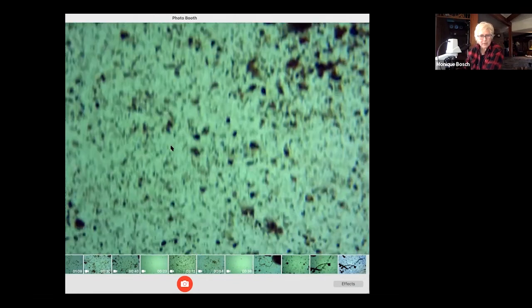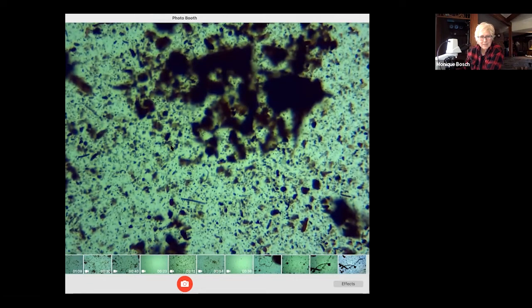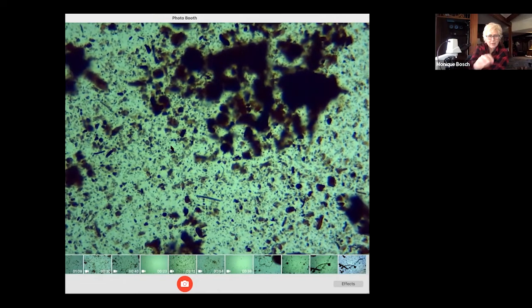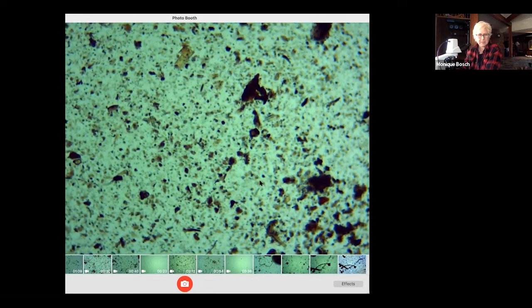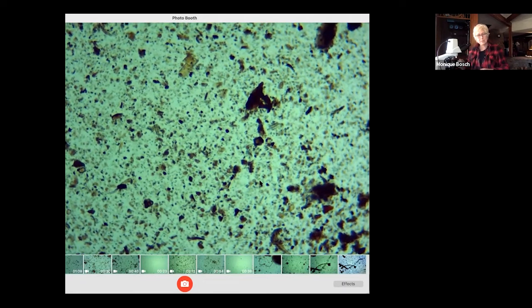Not seeing any predators. Sometimes it does take some time to find them. Here you have fungi. This is probably organic matter. This is just a giant clump. So I could do it again, but I did more want to show you the simplicity of making a slide. If you were doing compost tea, you would just go into the tea and add one drop and look at it under the microscope.